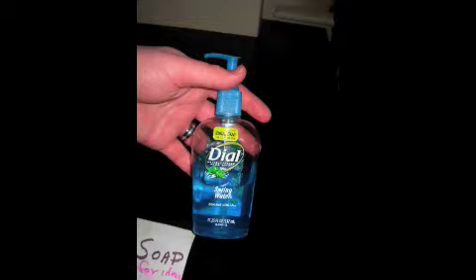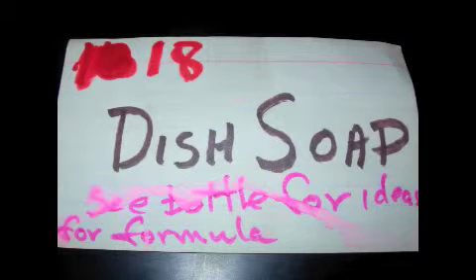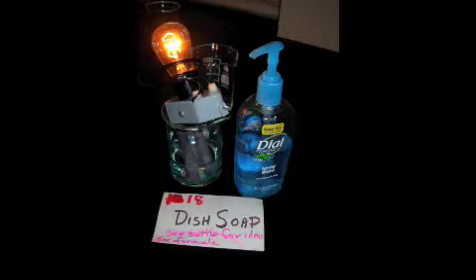The next sample we're going to be looking at is dish soap. In dish soap, there is a sodium compound and it is in an aqueous solution. So for the metal, it's sodium, and due to that, we're going to assume that the light bulb does light up, and it does, which shows that there is an ionic bond present in this product.